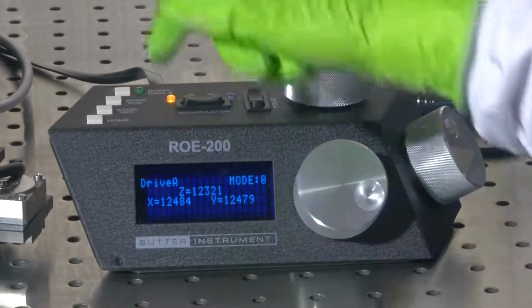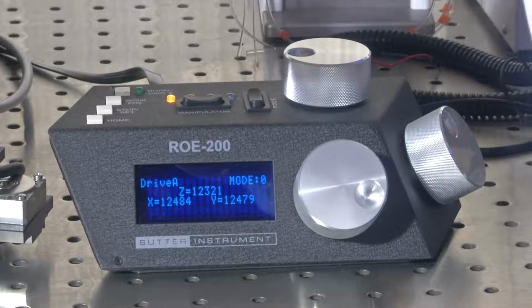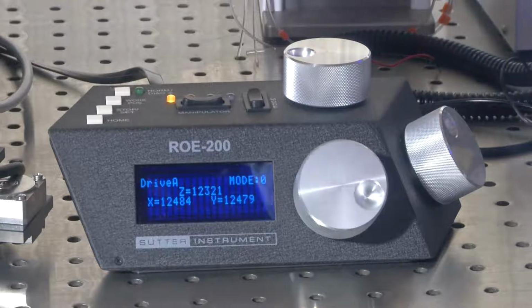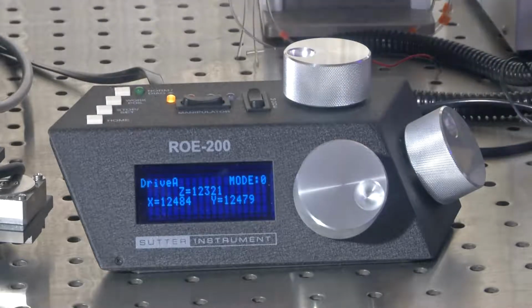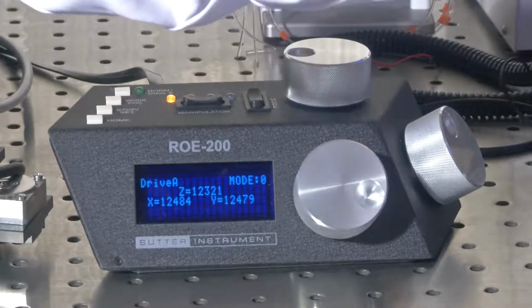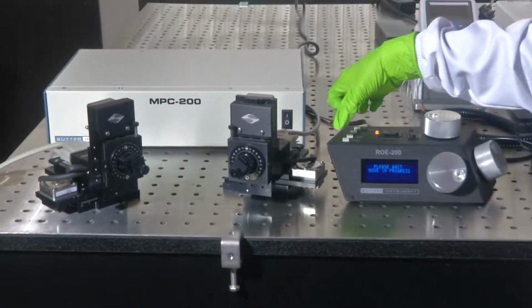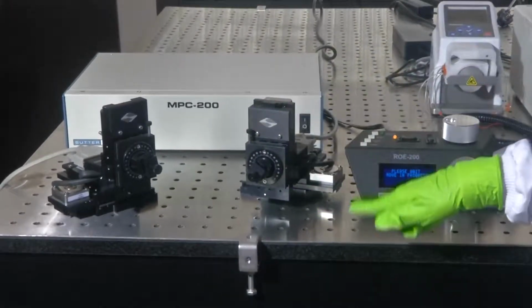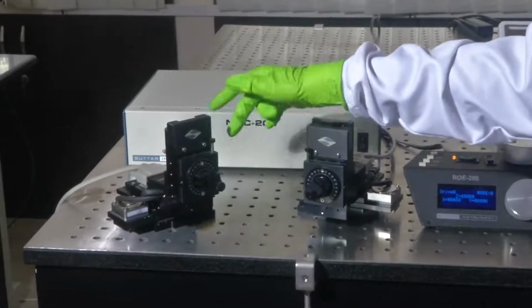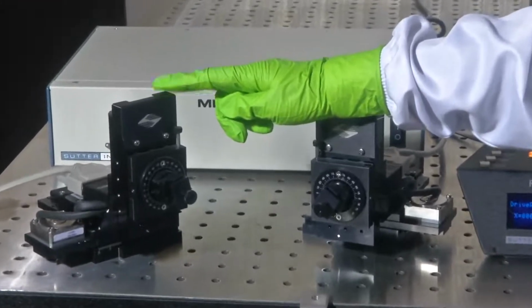Now, let us see the manipulator A, how the setting would affect its movement in the X, Y and Z direction. So, this is your manipulator A. Now, let us say I click on home. Like you can see, home is nothing but 0, 0 and 0. If you observe, this is back in all the directions X, Y and Z. In all directions the manipulator has returned back to home position.